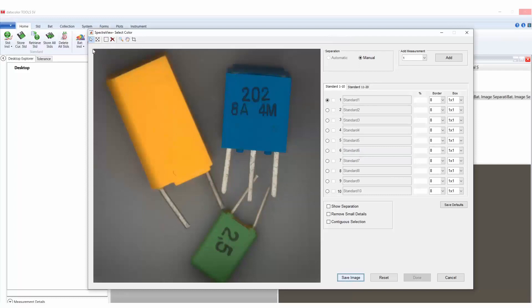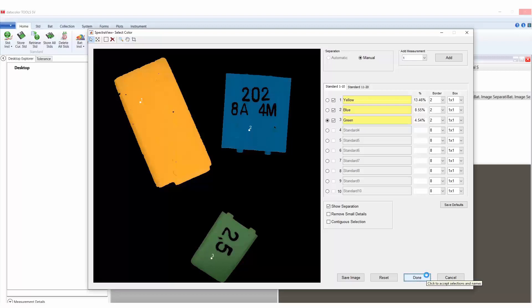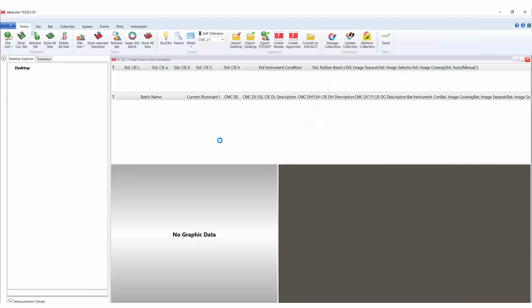To perform a color measurement within the same window, select the colors icon at the top of the color measurement window and select each individual color one at a time. Review the selections by selecting show separation. Change the border from the default of 8 by choosing the dropdown to select 2. Once the selections have been completed, the user can rename the selections if desired or change the borders per individual colors. Press done when finished and the individual batch measurements for all colors will populate to the desktop. The user can then determine whether they want to store, evaluate, or export the data.